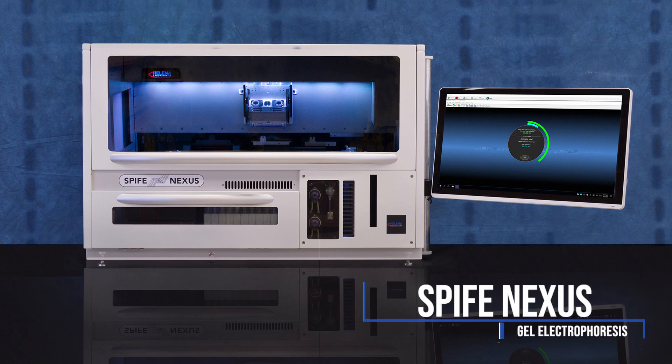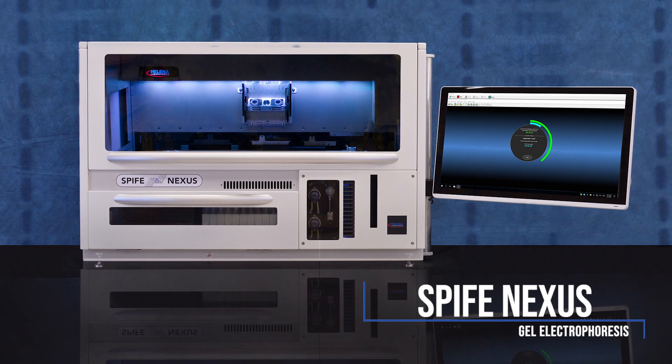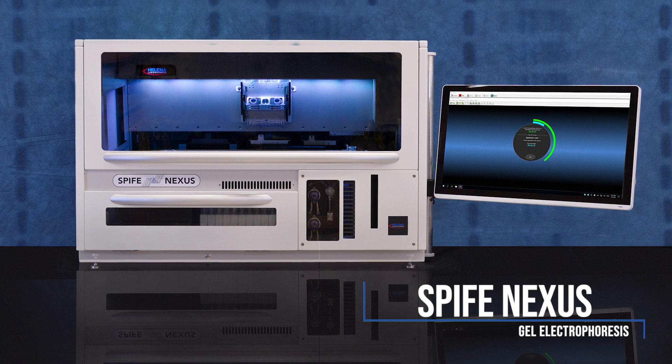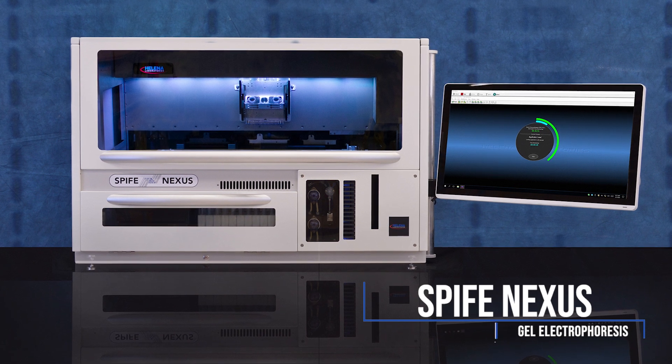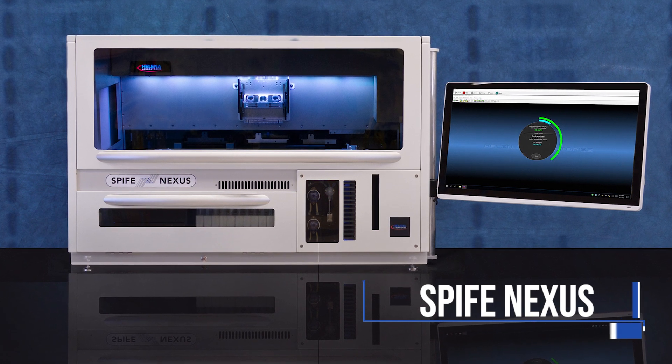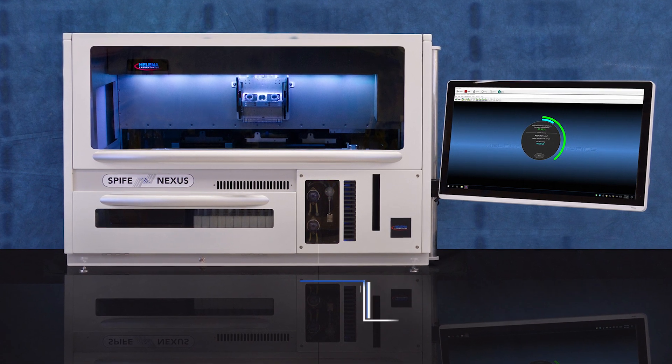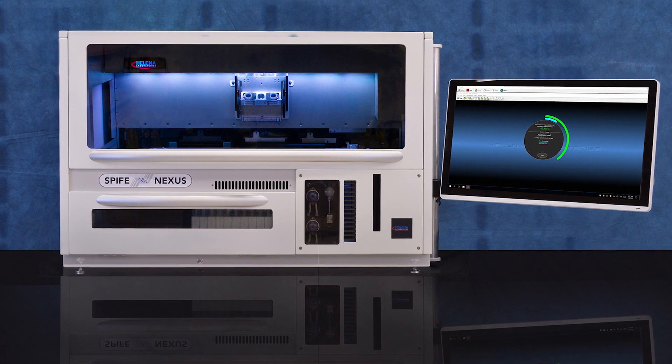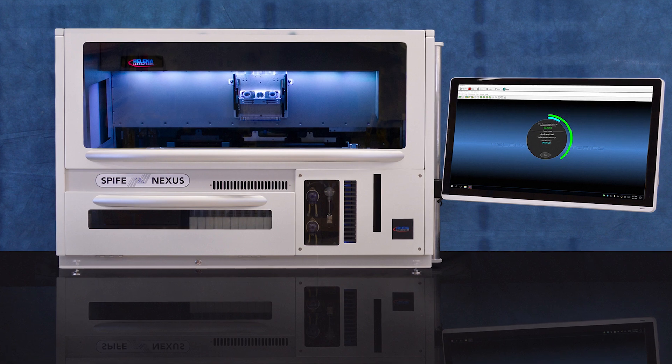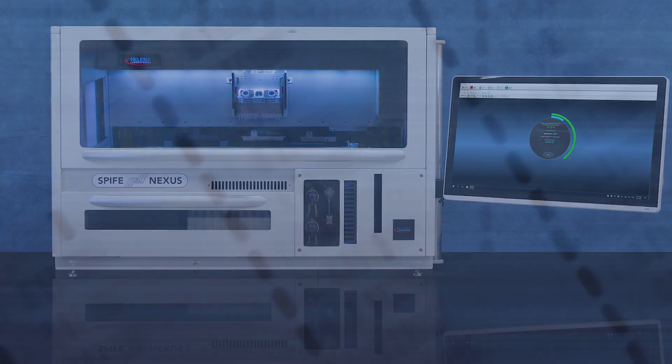Helena's SPIFE Nexus has revolutionized gel electrophoresis, providing laboratories the means to drastically reduce labor costs without compromising the highly sensitive assays needed for the best patient care.